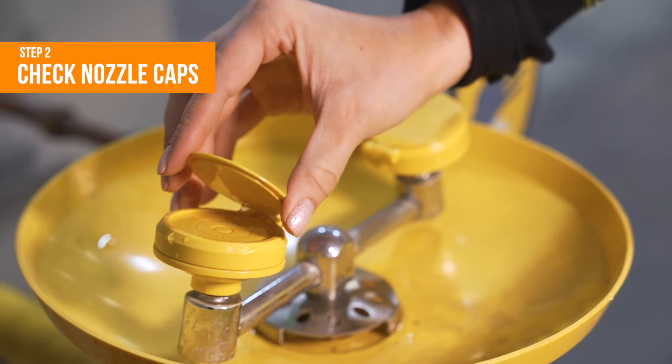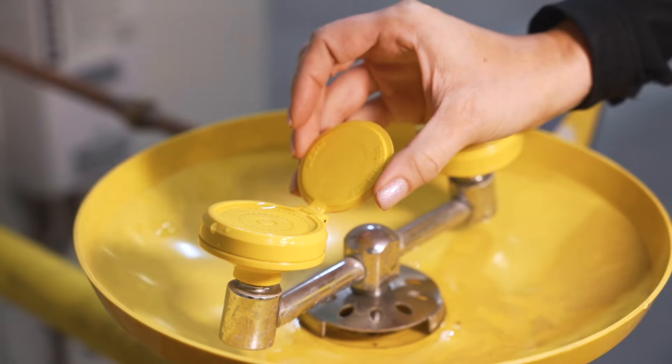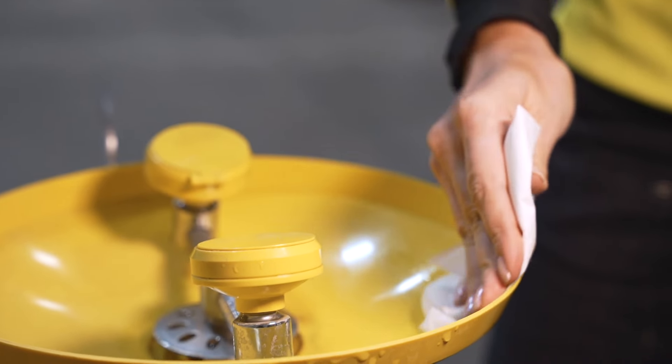Step 2: Make sure the nozzle caps are present and are in good condition to prevent contamination. Step 3: Check the cleanliness of the nozzles, the bowl, or the sink. Clean it if you need to.